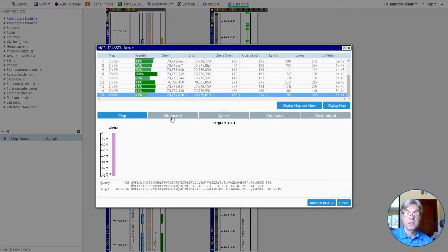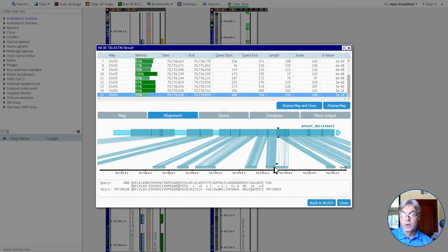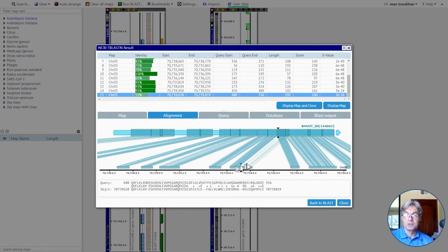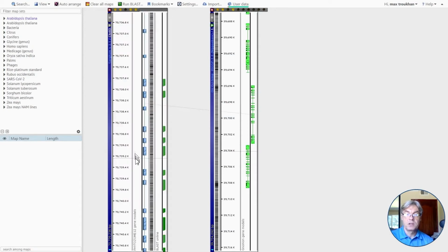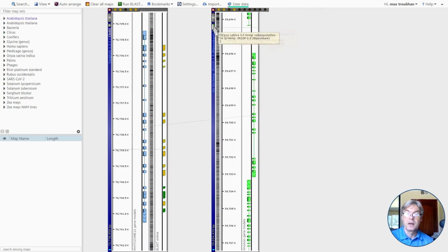So if you click this one and look at the alignment, you will see, aha, something is going on. So you have this hit, but it's sort of uneven in its density. So it's probably just one random hit, but the original part of the protein matches much better in this area. Okay, so talking about algorithms and applications, this application can help you with your algorithm if you take it further. Okay, so now we have two aligned regions.